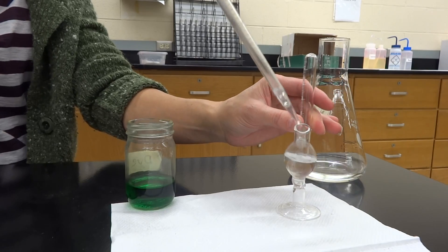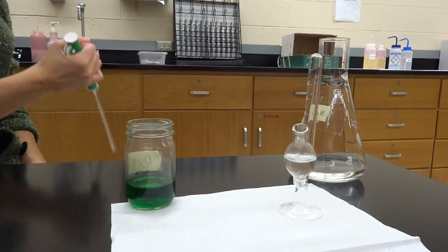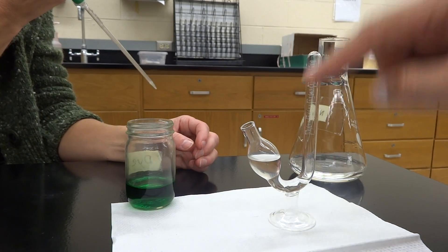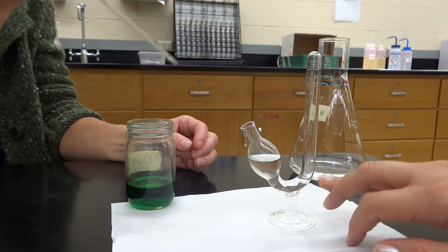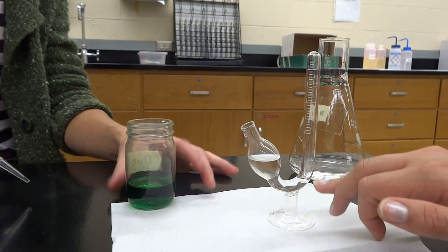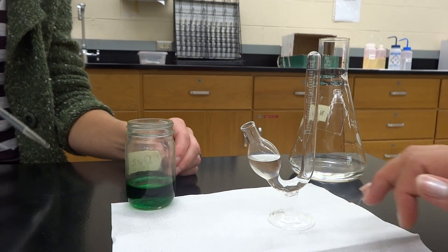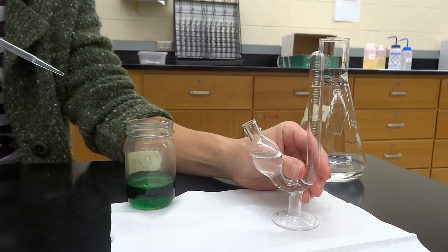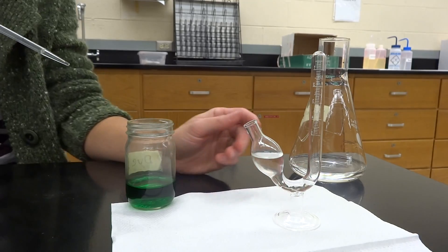You put that into the fermentation tube, and you'll see that the water is up here in the little bubble, but it only comes up to here when we're talking about the stem — or the arm, whichever way we're looking here.